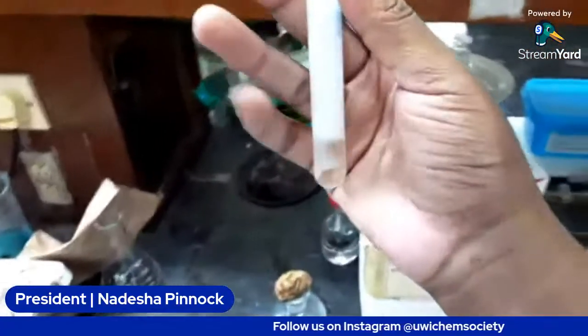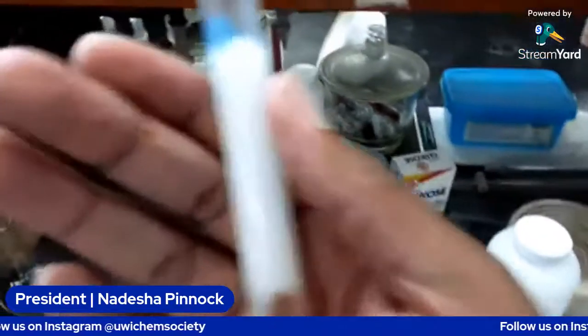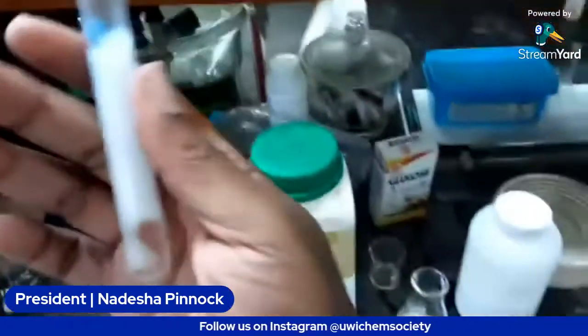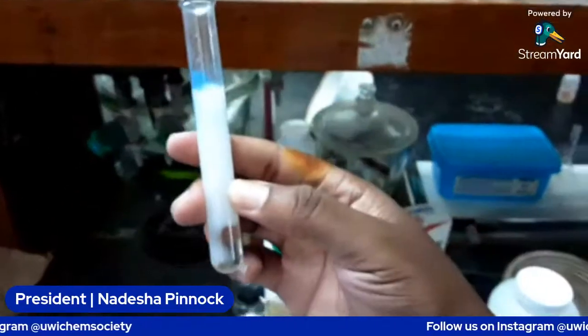Even though we had a cloudy suspension before when we added the ethanol, that's mainly because ethanol is polar, not as polar as water, but polar enough that not all of the oil is going to mix into it.